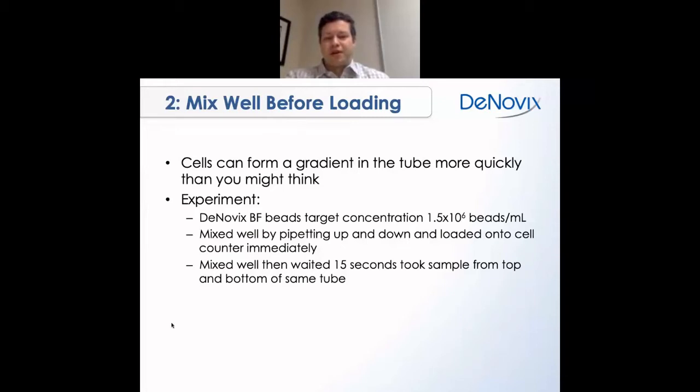So I just did a quick experiment. I took some beads, a target concentration of 1.5 million beads per mil, mixed them well, and loaded them onto the cell drop. And then I did the same thing, but waited about 15 seconds from after I mixed the beads to when I loaded them on the cell drop. Kind of thinking if you were to get distracted, if someone were to come into the lab and ask you a quick question, or you were to look down at your phone and see a text message, this is going to distract you for about 15 seconds.